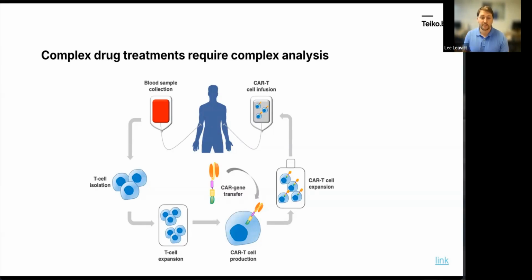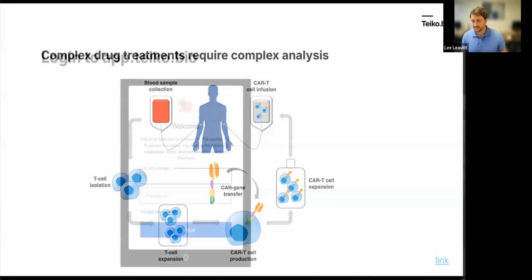We recognize the complexity of this field and have designed our web app to now allow the ability to normalize to any time point in the entire data set. Not only this, we pre-calculate statistics for all combinations of comparisons. No samples left behind and no cell populations left behind. And of course, our statistics are multiple test corrected, helping to prevent false discoveries.